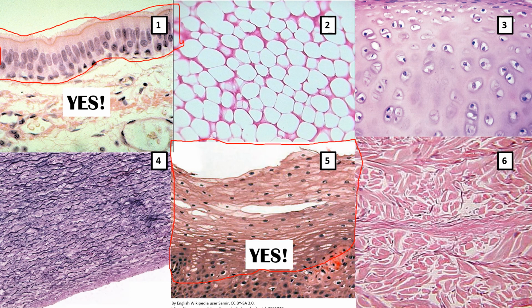They're roughly uniform. The other things we were looking for is that the cells are tightly packed together and that there's very little ECM visible. That's definitely true here. The cells are so close together that it looks like they share their plasma membrane. Classic characteristic of epithelial cells.